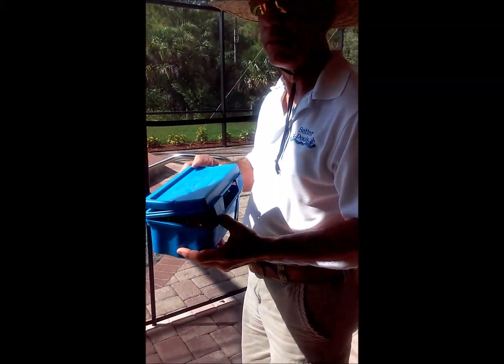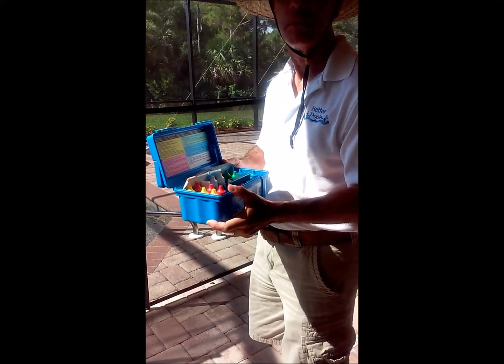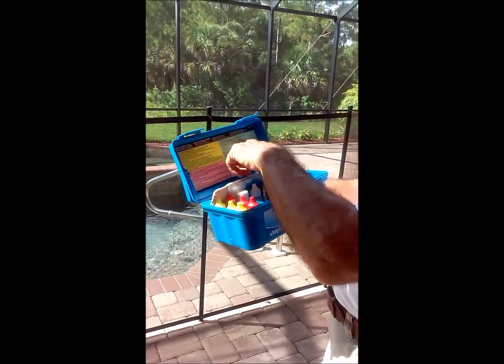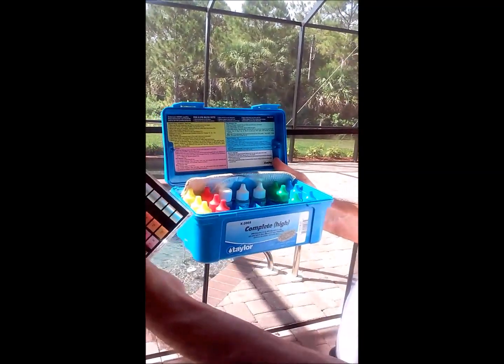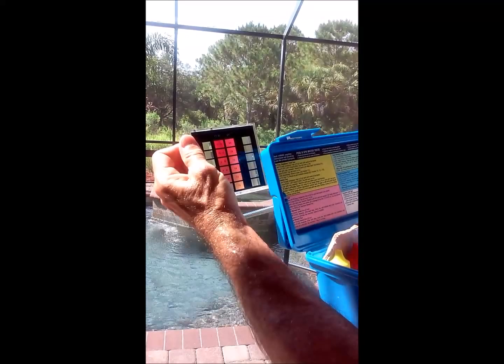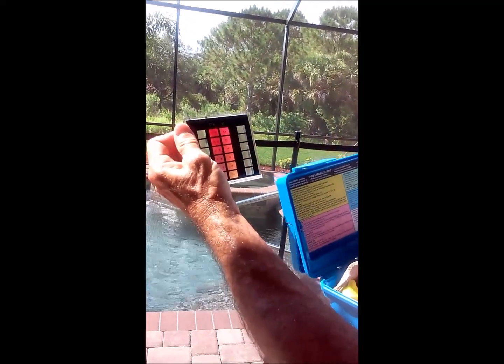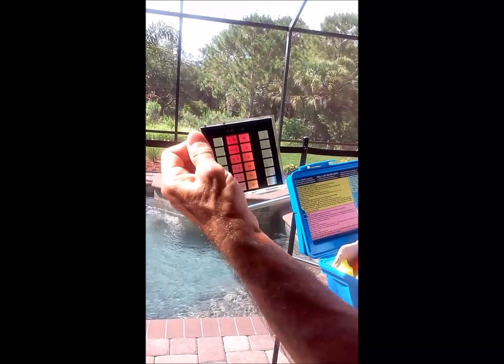This segment is about the Taylor test kit, which is another way to test your pool chemicals. You can put instructions inside the lid. You drop reagents into the container and on each side, whether you're testing chlorine or pH, you'll get a reading based on the color — you're just matching the color up.